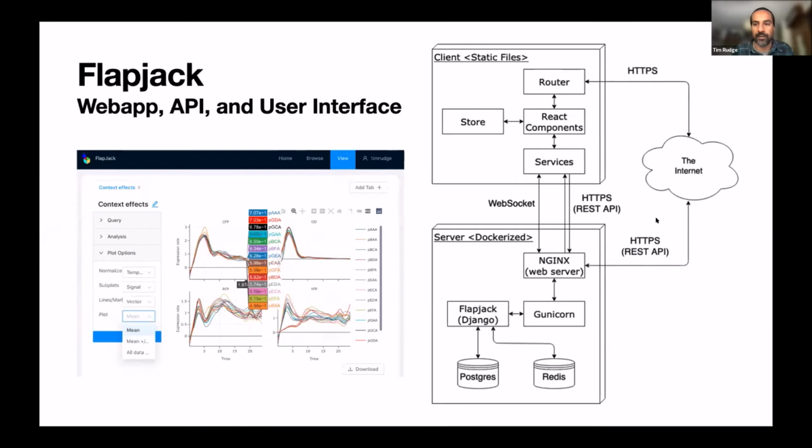But also this API allows other tools to connect directly. So for example, you might have a tool for the learn phase, which is doing simulations of genetic circuits, which can pull out automatically data from Flapjack. And we have a Python package which enables that. And Loika, which Gonzalo described, uses that Python package to link models to data and to do characterization of different components of genetic circuits. So essentially that's the background to Flapjack and a little bit about the structure of how it works.